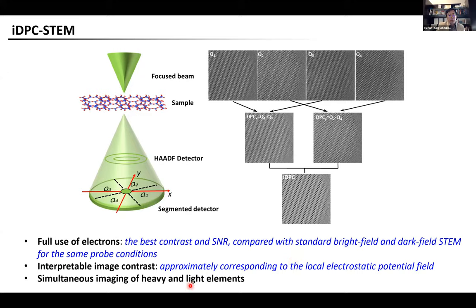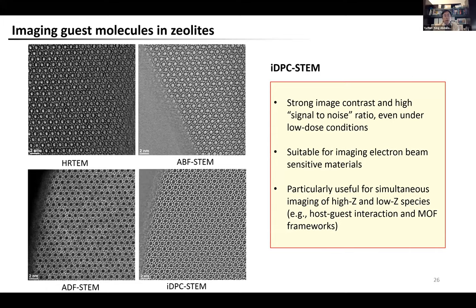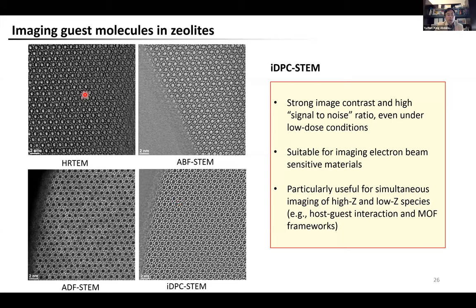Another advantage of iDPC-STEM is that it allows simultaneous imaging of heavy and light elements, which is particularly useful for MOFs composed of heavy metals with light organic linkers. These advantages are illustrated in an example comparing normal HRTEM, standard bright-field or dark-field STEM, and iDPC-STEM, imaging a zeolite with organic compounds adsorbed in its 10-membered-ring channels. Compared with normal TEM or standard STEM, iDPC-STEM shows the best contrast for the zeolite framework, and only in iDPC-STEM can we clearly see the adsorbed hydrocarbon compounds in the channels.